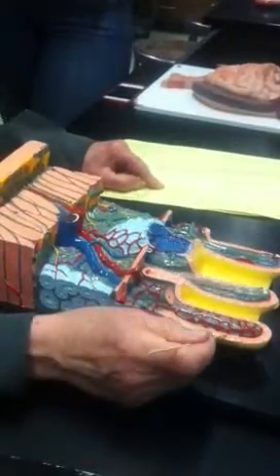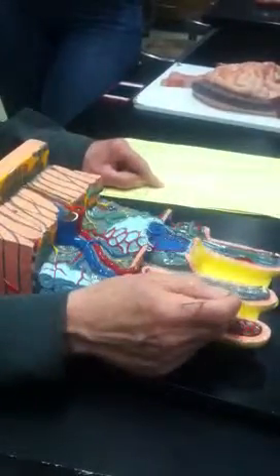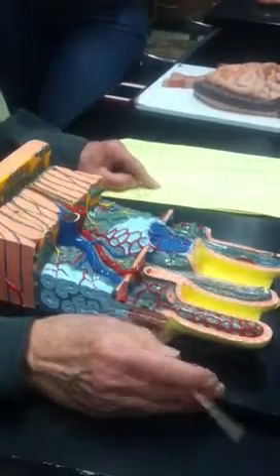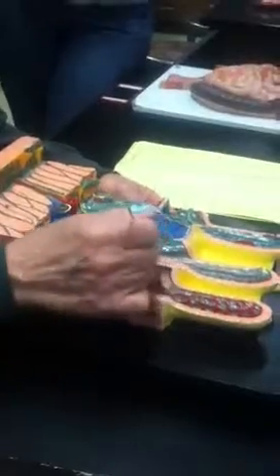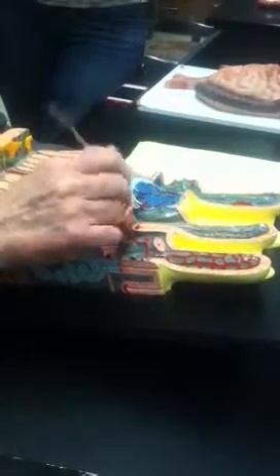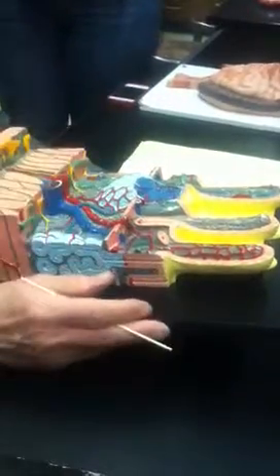Columnar epithelial cells are the kinds of epithelial cells that line the intestinal tract. So all of these, the ones that aren't goblet cells, are columnar epithelial cells. Paneth cells. Down at the bottom of these crypts, shown in red, you see these little red things? Those are Paneth cells. Now they contribute to immune function.